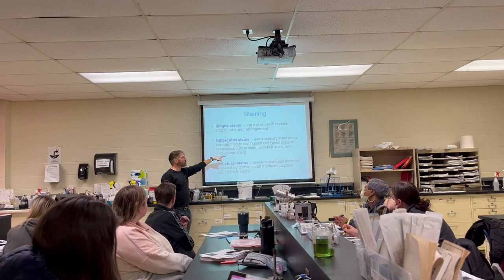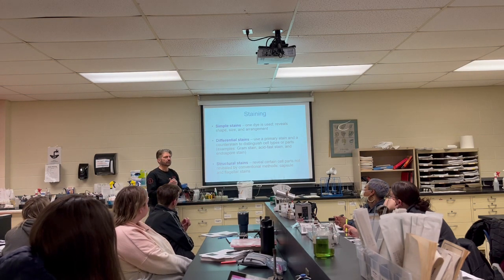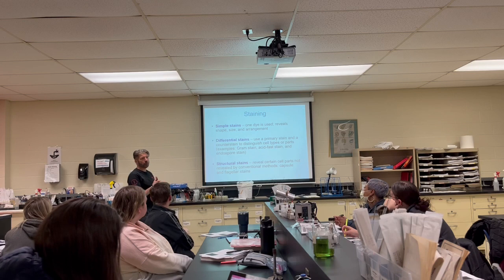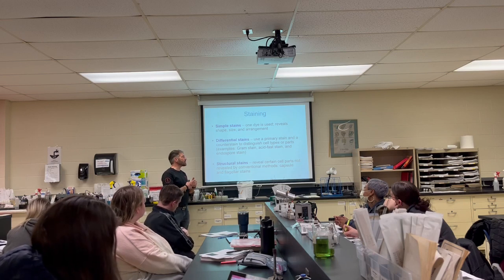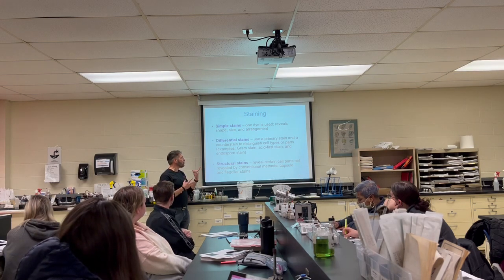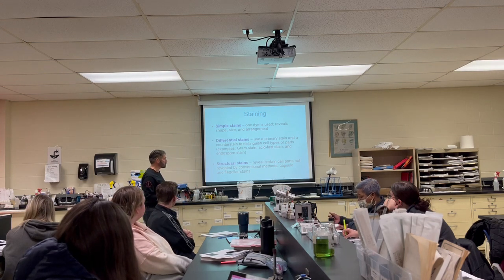Absolutely. Now, what if something's acid fast? What does that sound like? It sounds like it's probably harder to kill. You guys have heard of tuberculosis? It's got a very waxy coat. It's acid fast. So if we're staining something and it wouldn't gram stain, and even the acid stain wouldn't work, but I was able to stain it with endospore stain, these stains will tell us what it is and how we would treat it.